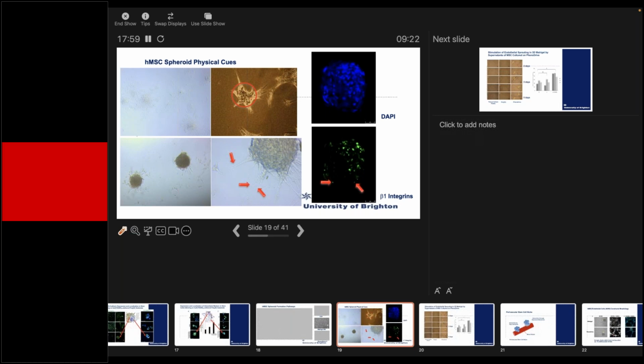Here you can see that the stem cells during migration are blebbing, forming and releasing matrix vesicles, which are deposited on PhenoDrive and reached out by the cell filopodia. And to prove that these were matrix vesicles, we have done staining with integrin, considering obviously that those vesicles could be fragments of the cell membrane, but we are now conducting more specific studies to characterize these vesicles. And here you can see another beautiful example of the formed spheroid.